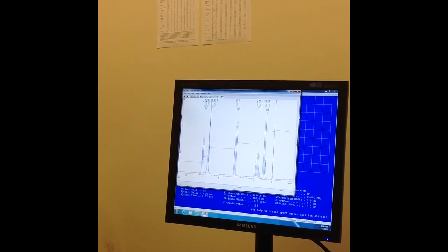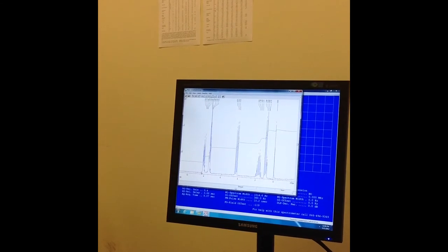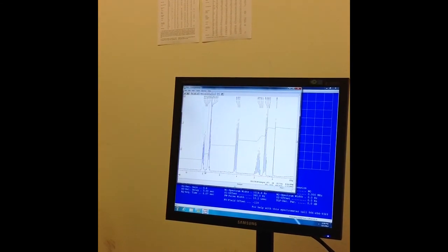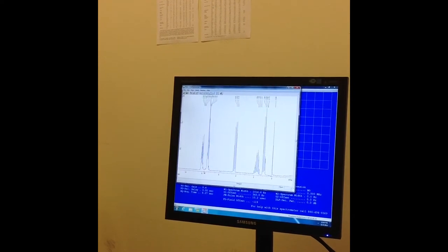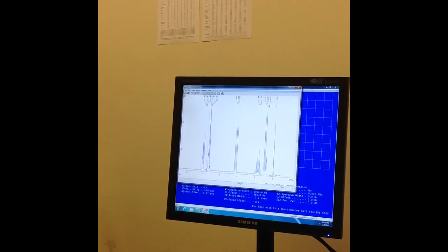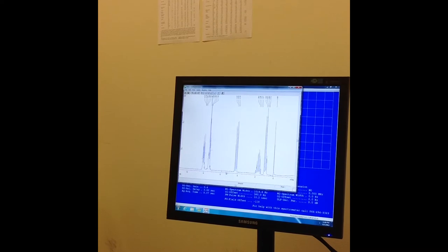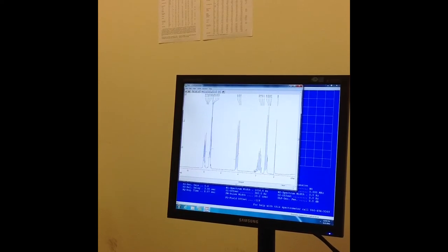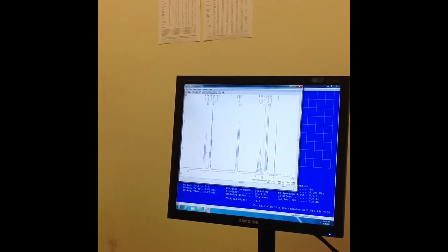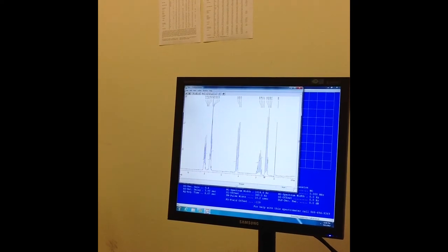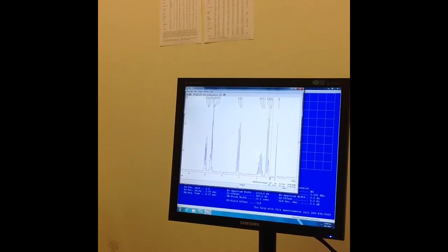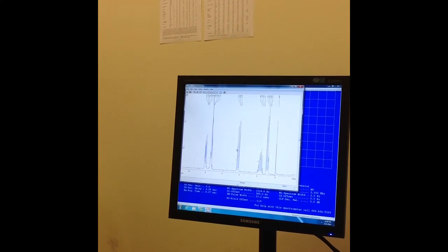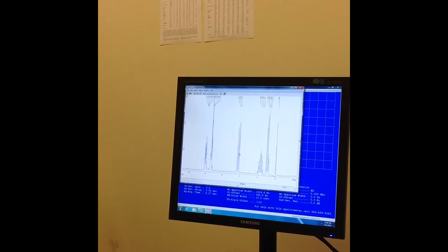What I'm going to do is I'm going to take the left mouse button, I'm going to click twice on the left side of the peak, I'm going to click once on the right side, all with the left mouse button, and I'm going to continue doing that for each peak. I'm going to do that real quick. The only one I don't do it for is the TMS, because I really just don't care about that right now.